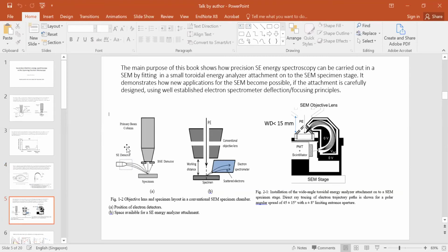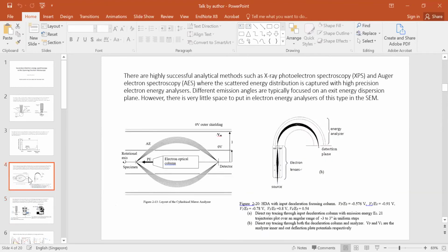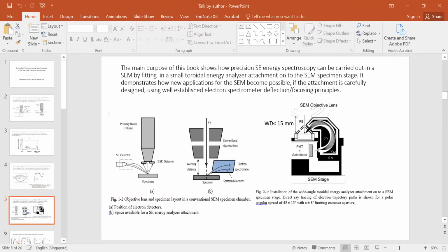Usually though, because there's very little space between the final pole piece and the specimen, just less than 20 millimeters or less, there's actually very little space to put in any analyzer. If you look at these analyzers, they're actually very big. The cylindrical mirror analyzer and the hemispherical analyzer come onto chambers, dedicated UHV chambers. To put an energy analyzer in that small space inside an SEM is quite challenging.